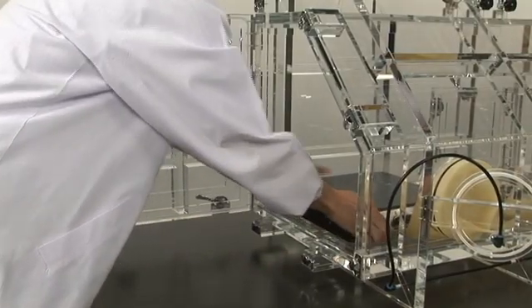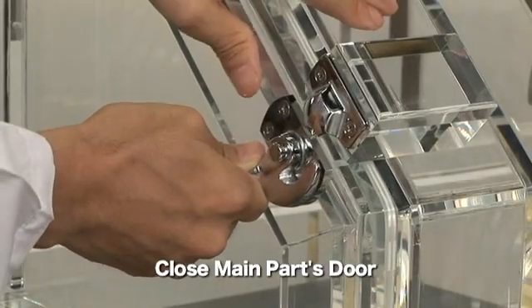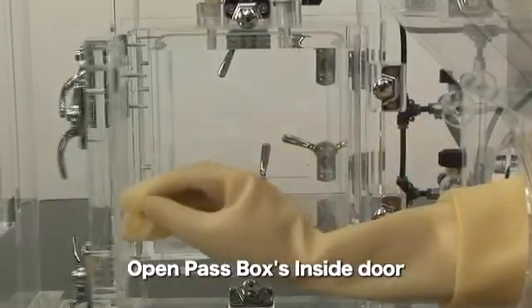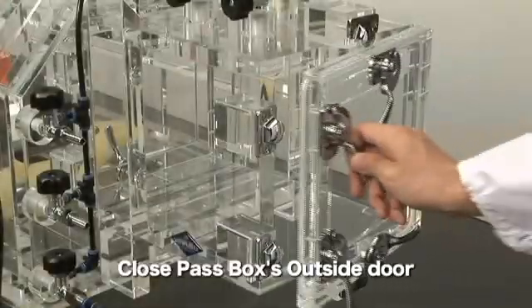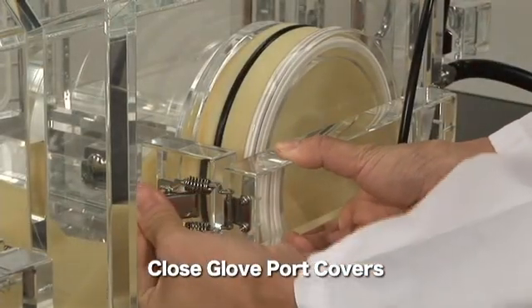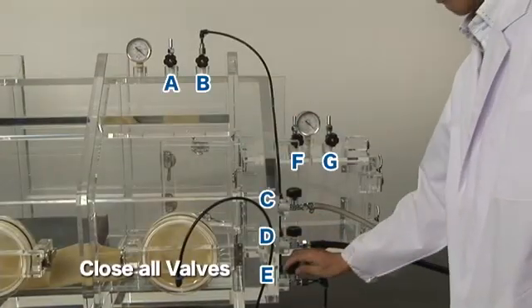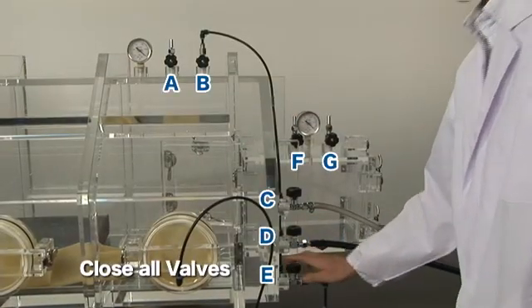Insert items from the left side door and seal the box in these steps. Close all valves from A to G.